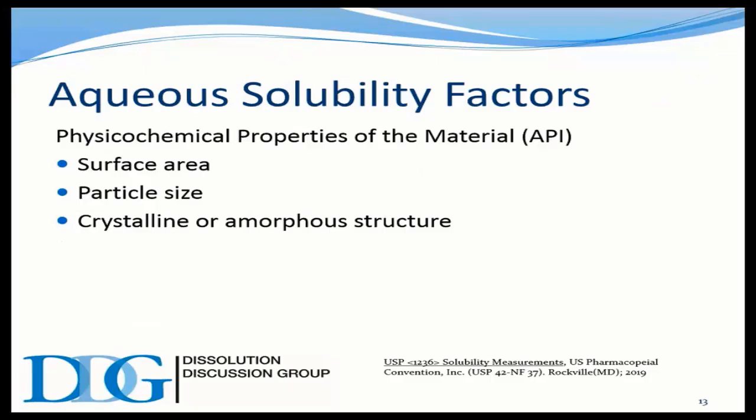Of course, surface area and particle size are huge for allowing it to solubilize. In other words, large particles compared to a micronized powder, if you will, can have a tremendous impact on the rate at which something goes in. Now, these do not necessarily have a big influence on extent. It may take longer to go into solution, but eventually the drug will be in solution in a saturated state, so we can determine that concentration.